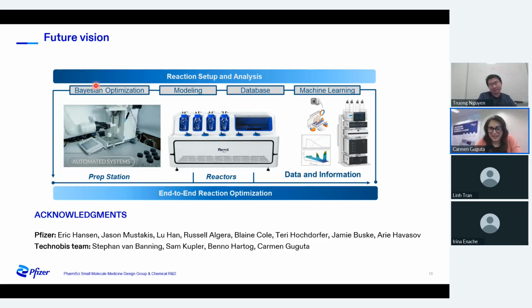Indeed. And somebody had a question related to the temperature range of the reactor. Maybe we can address that one already because we are talking about temperature. I think the lowest is -25 degrees and the highest 150 degrees.